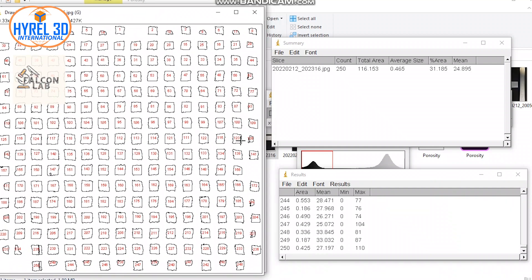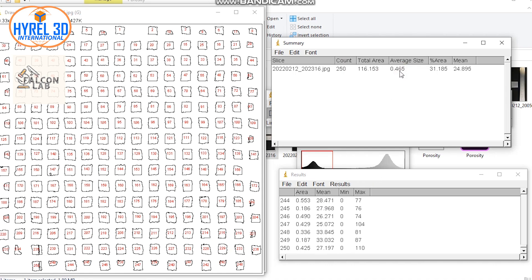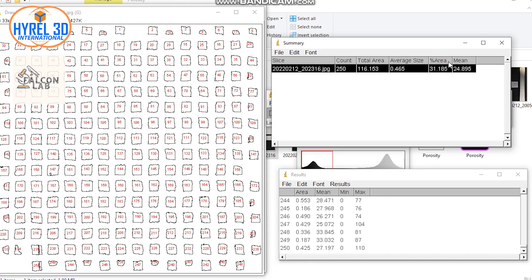The second is to show you the porosity percentage and the average size of the pores. You can see we have 250 pores with an average size of 465 micrometers. The porosity is approximately 31 percent.